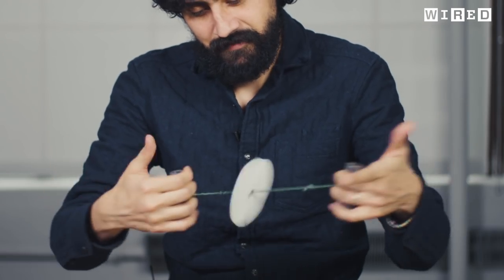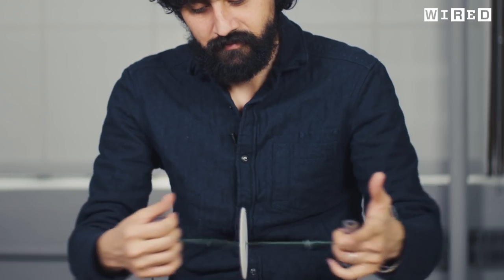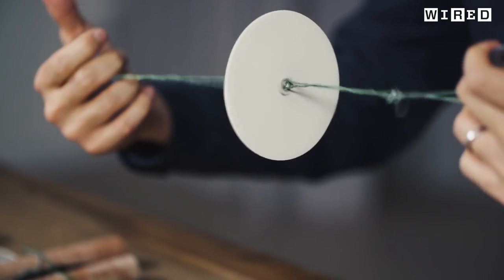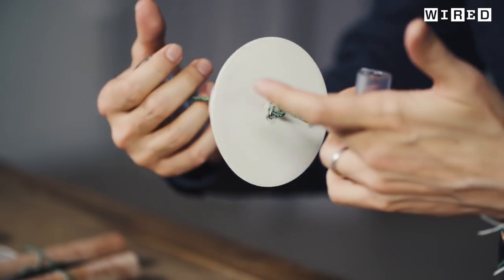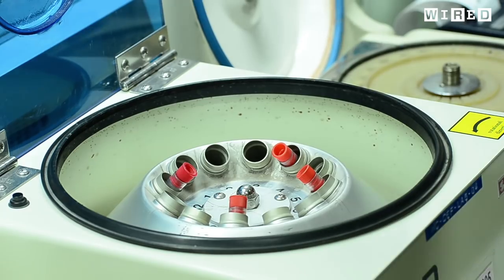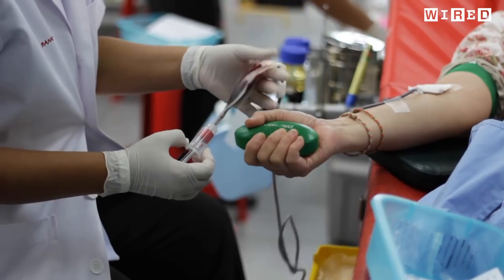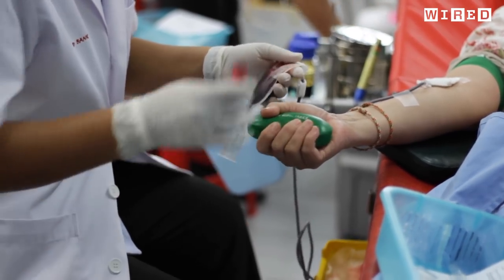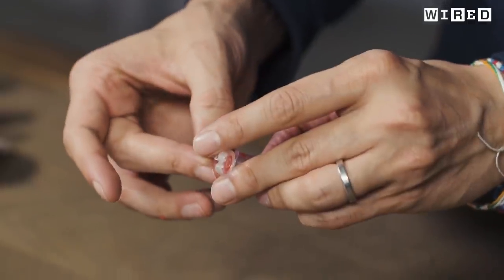That is the sound of a groundbreaking scientific device — it's called a paperfuge, a centrifuge made of paper. Like a traditional centrifuge, it works by separating the contents of biological samples by spinning really, really fast. That's an important first step for diagnosing illnesses like malaria and HIV.